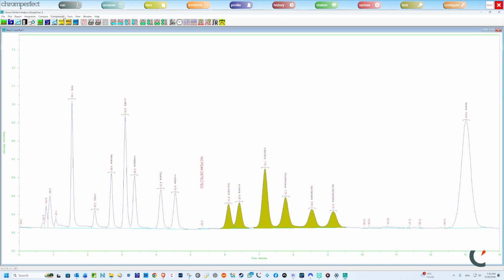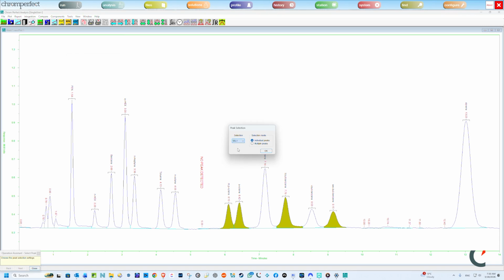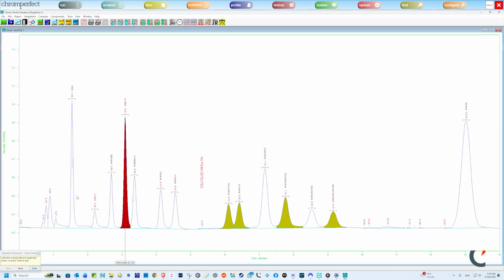To remove a peak from the selection, select the SEL- option in the dialog and repeat the left-click, right-click process to remove the peak from the selection. As you might have guessed, the colors of each selected peak can be changed in the Plot Properties dialog using the Color tab. Although the peak selection functionality is primarily designed for preparing formatted reports, it is often helpful during analysis to clearly identify particular peaks when reviewing complex chromatograms or comparing multiple runs.